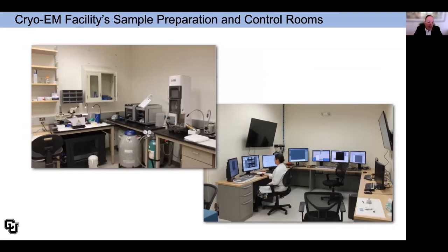The CryoEM facility has dedicated spaces for sample preparation, shown here on the left, as well as a central control room in which all of the computers that drive the microscopes and data analysis are clustered. And the idea of this control room is that it provides an environment where users can interact and share expertise as they use the facility to collect data.